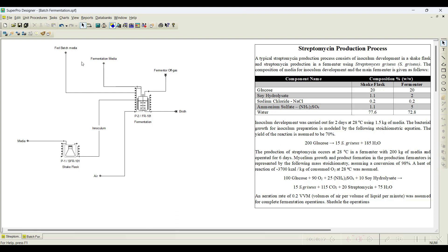In a fed-batch process we also need to feed the fermenter initially with some quantity — we need to charge media, and slowly other media will be slowly added throughout the process.